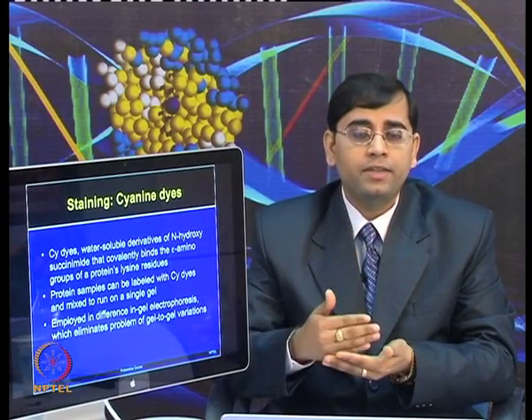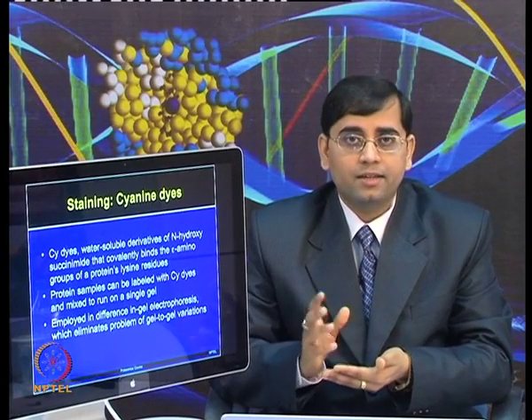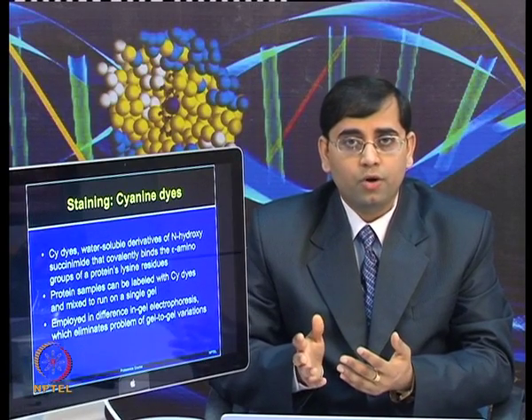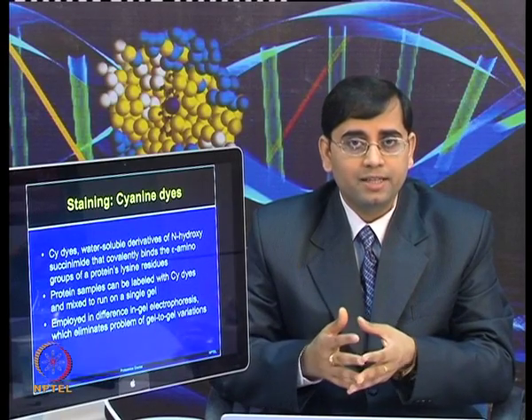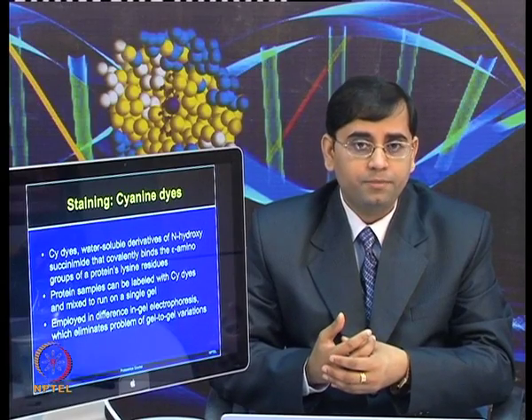Now, when you are separating everything in one gel and just changing the fluorescence scanning parameter, then there is no variation overall, and at the end you can obtain from the same gel 3 different images based on the emission fluorescence spectra.